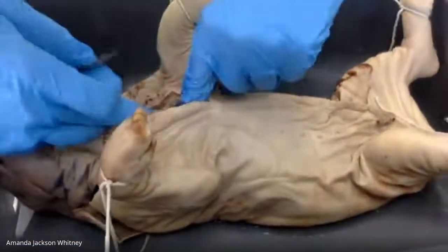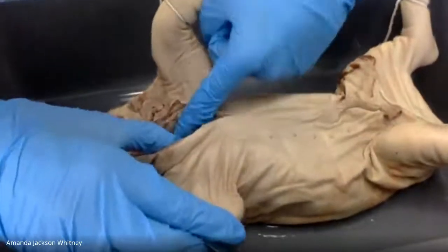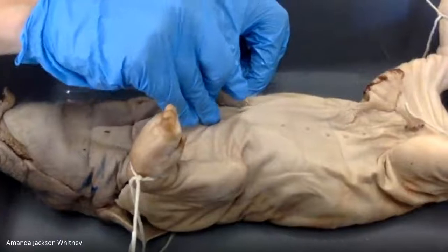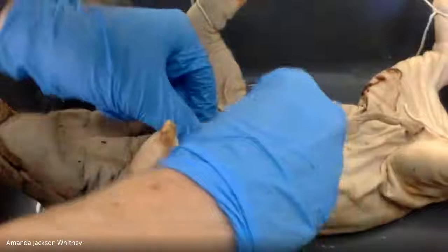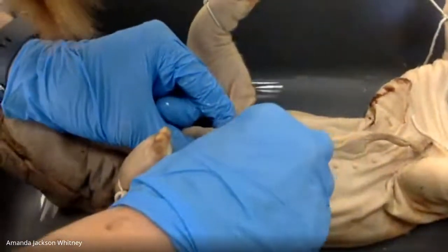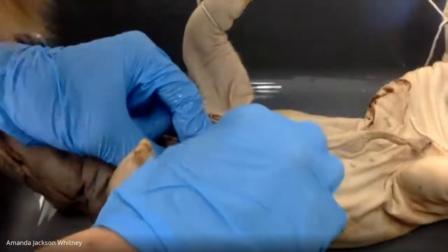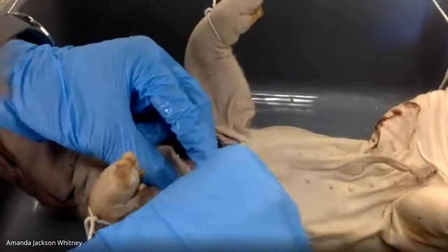Pretty cool. Trying to feel now for the diaphragm. We cut through the intercostals, cut through some ribs. I'll show you guys in a little bit. You can feel them. They're kind of tough to cut through as well. Can you guys hear that? That's that bone tissue. And I just cut through the pericardium.